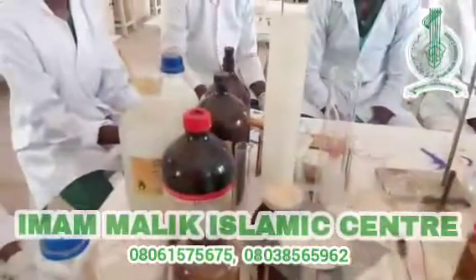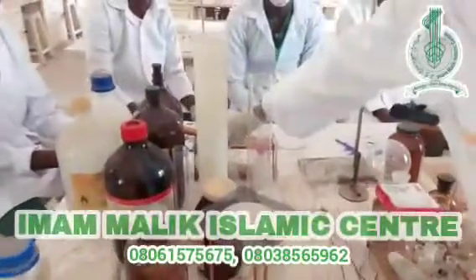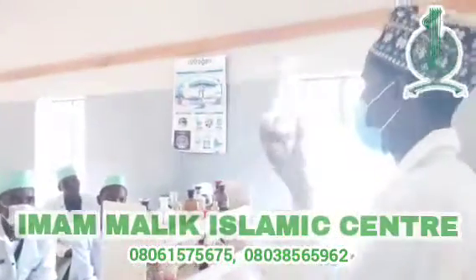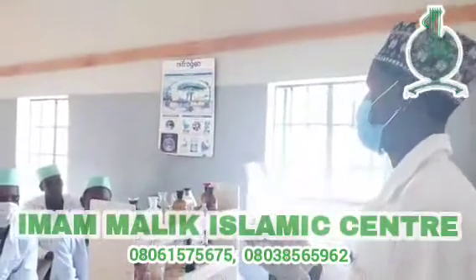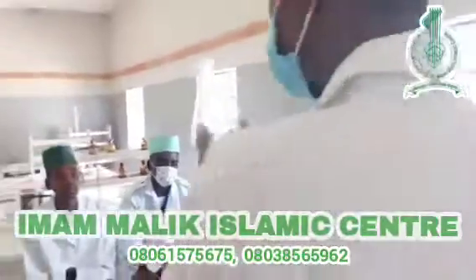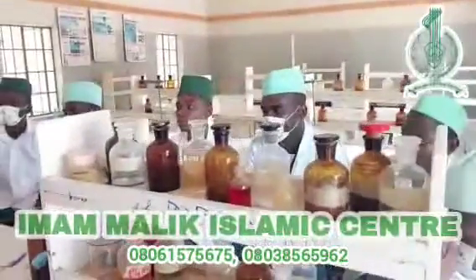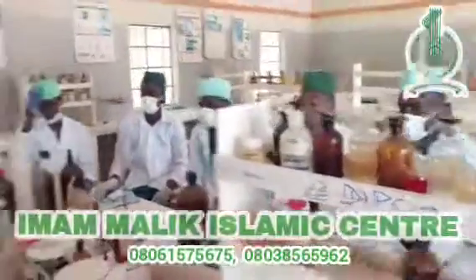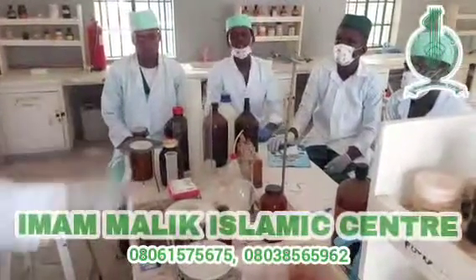We have conical flasks. So this is a conical flask. This is graduated 250 mils. We have a bigger one. We have a smaller one. But this one is graduated 250 mils. So mostly it is used as a container, like the beakers, the conical flask.